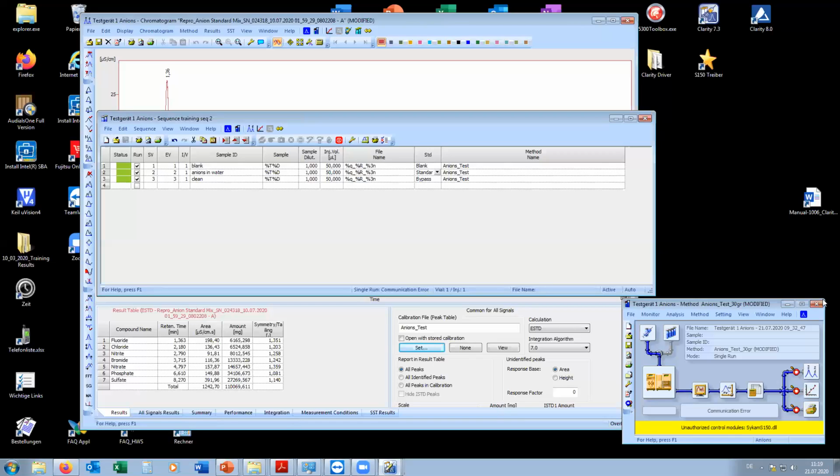Understand. You show me this one, right? Yes, exactly. So the instrument you connect as you want with RS232 cables, and you connect this box to the computer. Understand now. Good. So I think the computer part is almost clear. The standard computer will work. I think it is just a mouse pad. Nothing else.